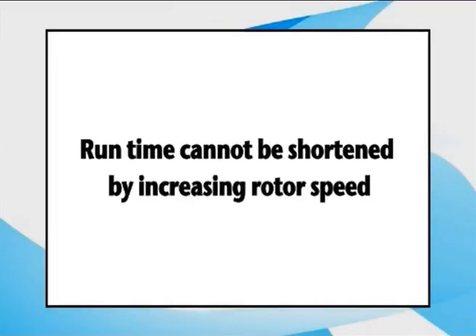It's important to note that the runtime cannot be shortened by increasing the rotor speed. This only results in changing the position of the zones in the tube, since the gradient material will redistribute further down the tube under greater centrifugal force.